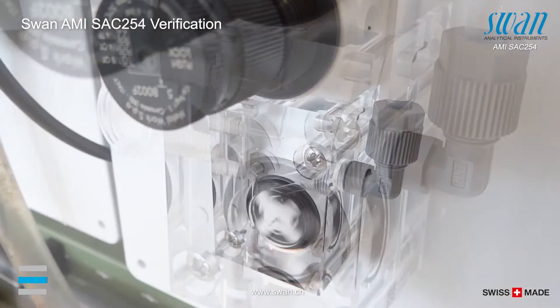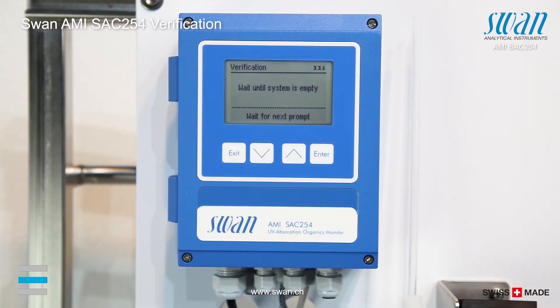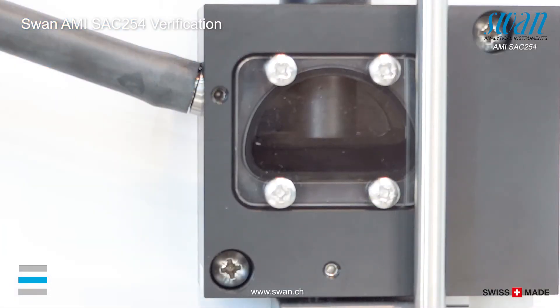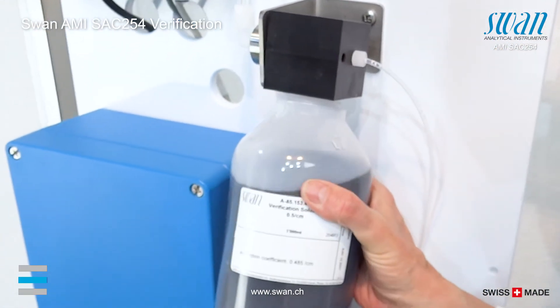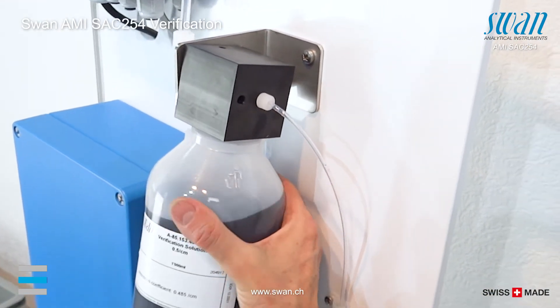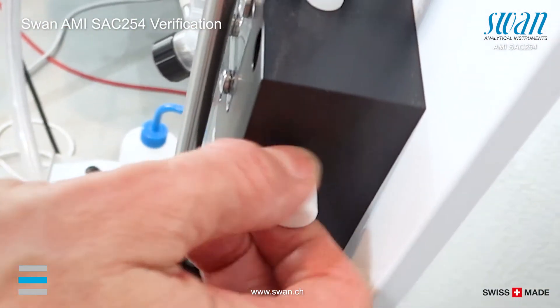Stop sample flow and continue with ENTER. As soon as the system is empty, the standard bottle is screwed onto the holder and swung upwards. Open the tab.